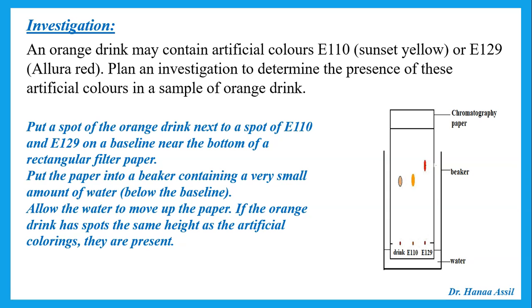Now, if the orange drink has spots the same height as the artificial colorings, they are present. So in this case, does the drink have E110 or E129? It has E110. Since the spot from E110 went up the same height as the spot from the orange drink.